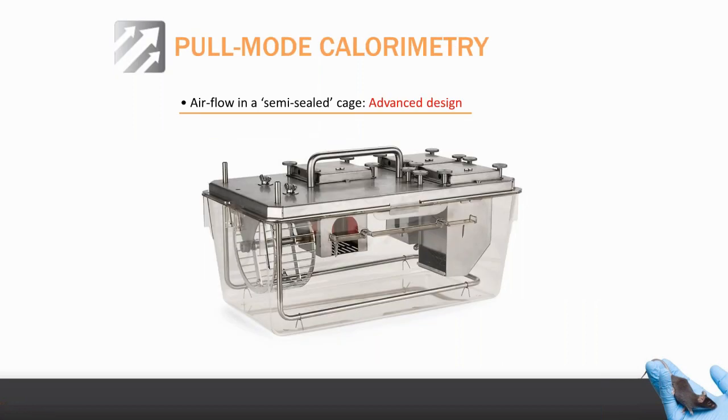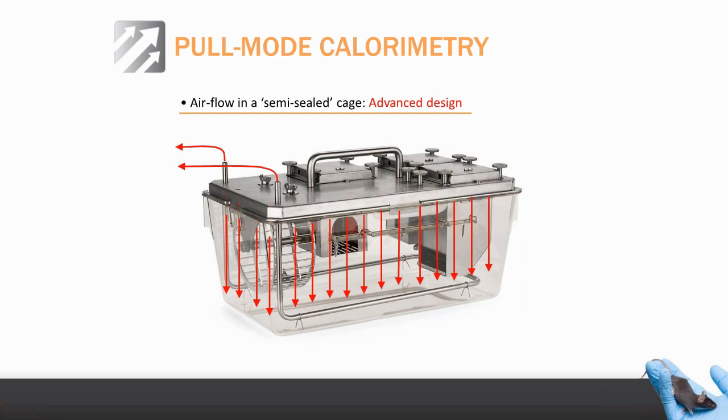Now, what about the cage in terms of metabolic measurement? Well, most cages in the older systems are sealed. This cage is not. There is an imperfect seal around the top of the cage. And you notice the steel tube over here that runs around the bottom of the cage. That is perforated by hundreds of tiny laser punched holes and gives a very distributed, even air stream going down from the cage lid to a very distributed area around the periphery of the cage, pulling all of the air that the mouse has exhaled with it.